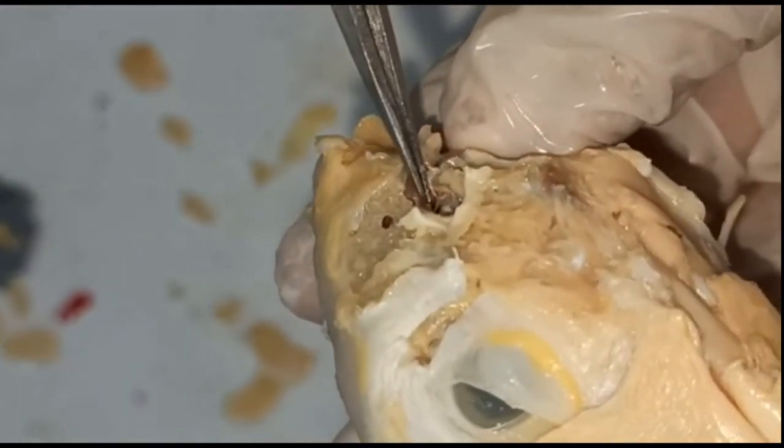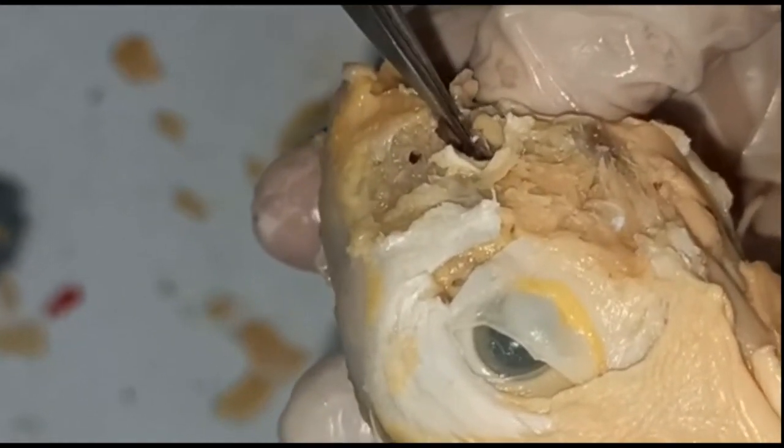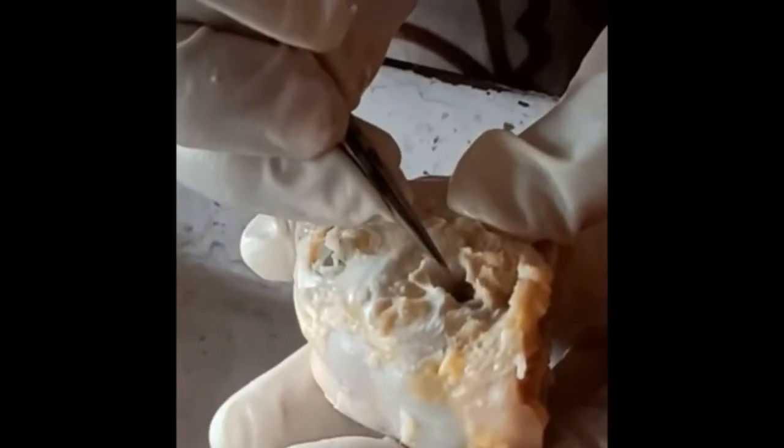Now for mounting the columella, we have to hold it with the help of fine forceps and we can remove it, then we have to keep it on the slide and mount. So the columella appears like this under the microscope.